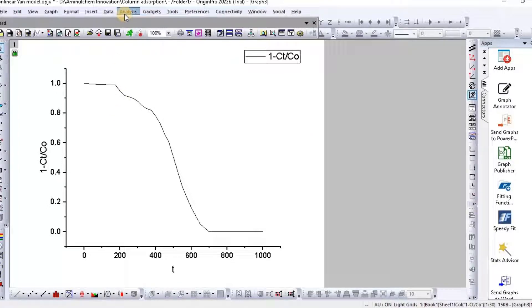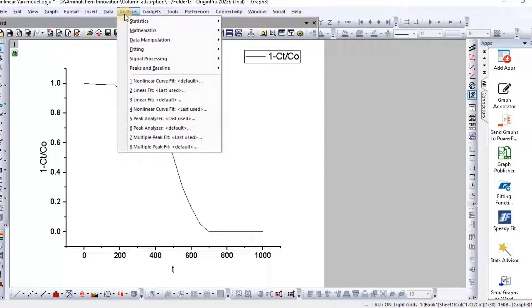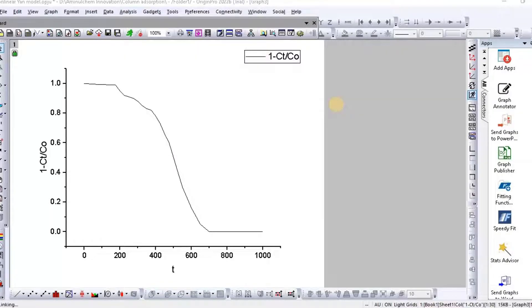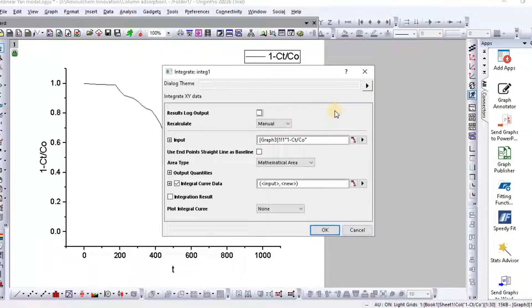go to analysis, then go to mathematics, then go to integrate, then go to open dialogue. Then just click OK.